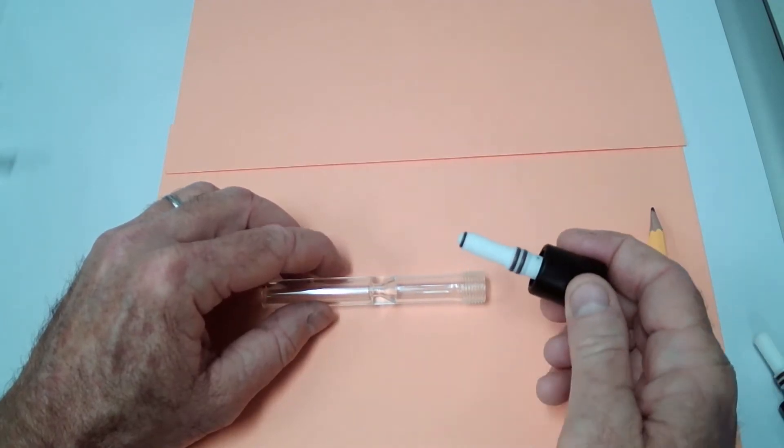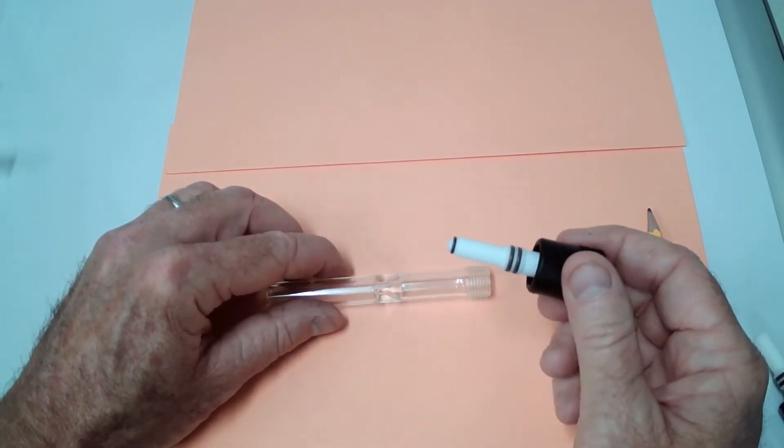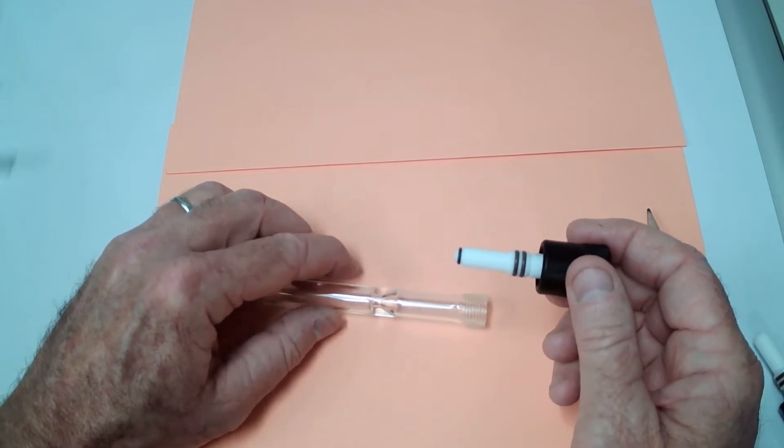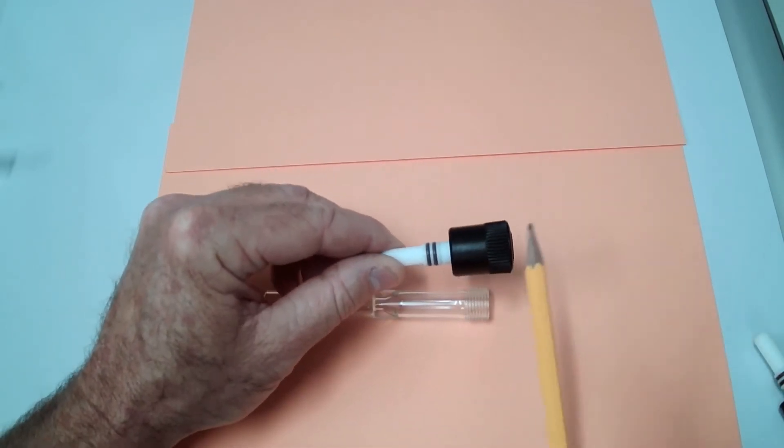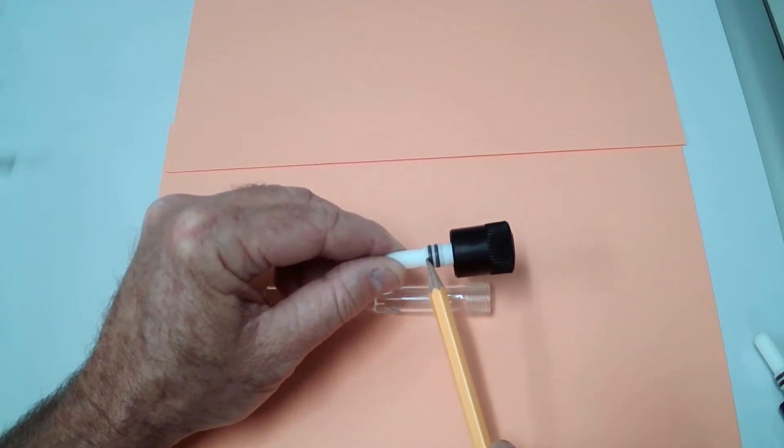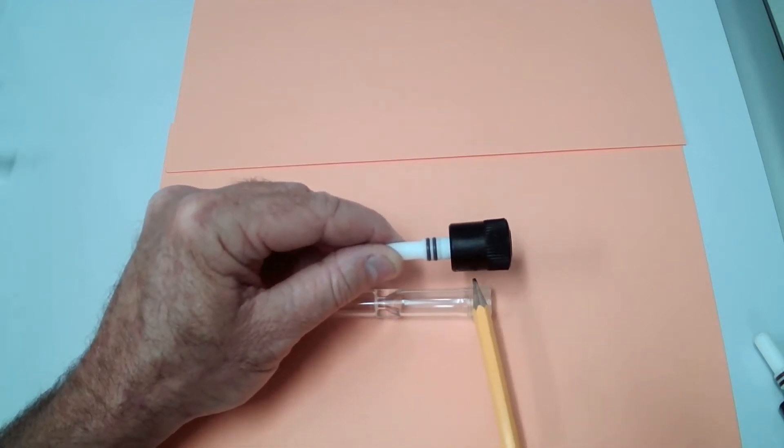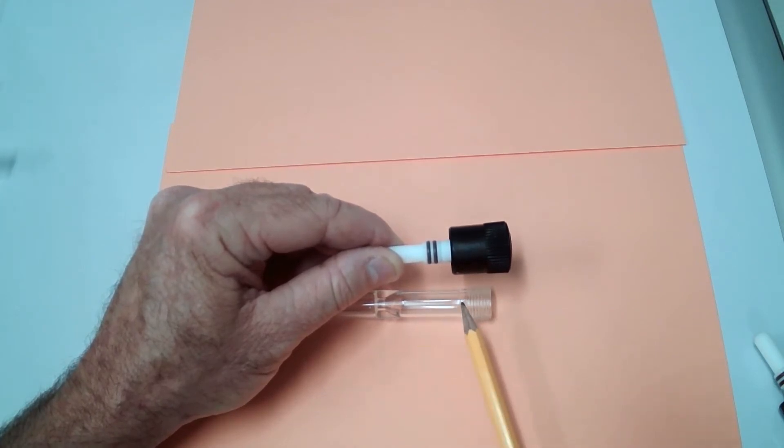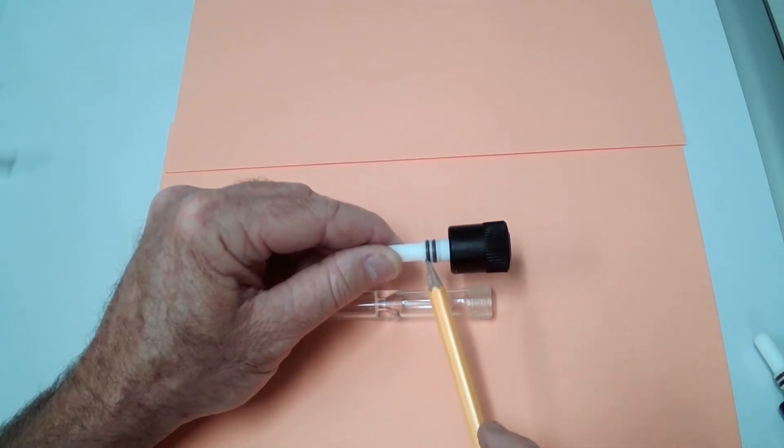They have a corresponding plug with a fine thread and a Teflon ridge that comes in contact with the precision bore and washes material down away from the top portion of the thread, backed by two Viton O-rings.